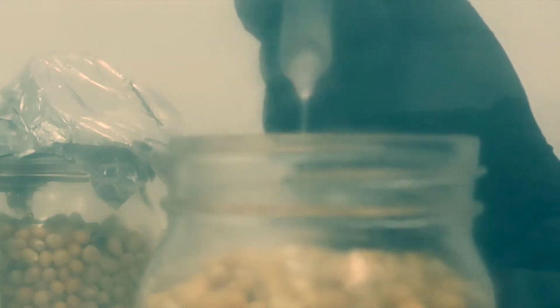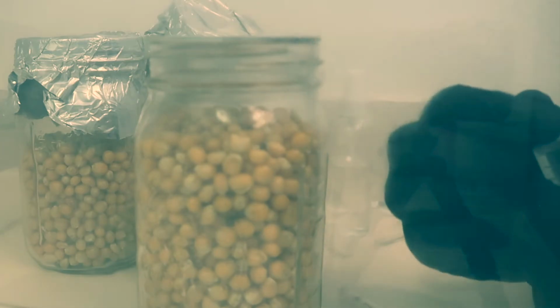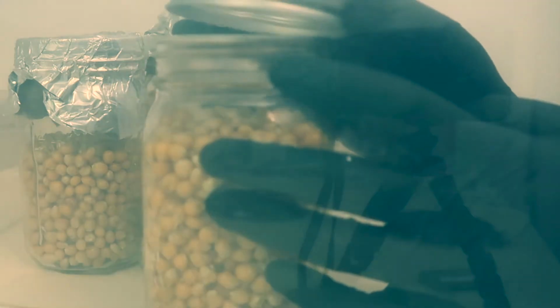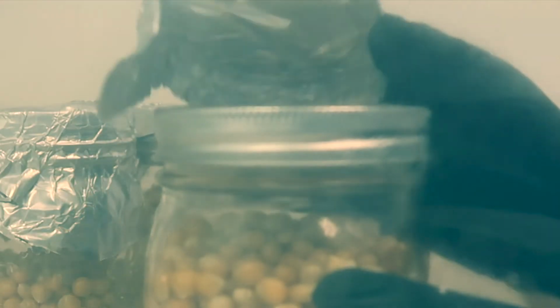Now the needle is no longer sterile, so I would want to flame sterilize again if I ever use it after this. Squirt a little bit of liquid around the sides again, not really measuring, but I'm judging about 1 to 2 cc's for this quart jar, that's plenty. Remove my needle and replace my little luer lock syringe plug just like this. The spore syringe inoculation is complete, and this time I'm not going to mix it up. I'm just going to replace the lid just a little bit looser than finger tight. It can still breathe, and I'll replace my dust cover.